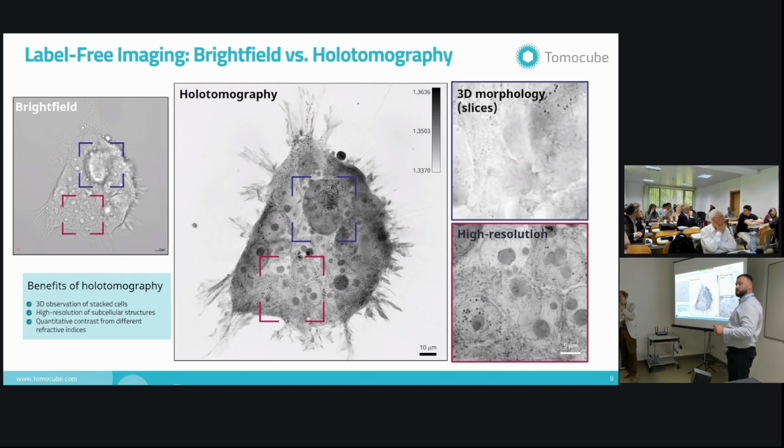I know that for some micro tissues or organoids, you need tissue clearing in order to see better and with more resolution for fluorescent signals. Is it still necessary for this type of visualization? It goes back to the question about the fixation. If you remove things from there, you're going to lose contrast in this case. Of course, the bigger the object, the denser the object, the more scatter there is going to be. We want the scatter because that's the measurement itself. Too much scatter is going to be hard to track back to where the signal was supposed to be.